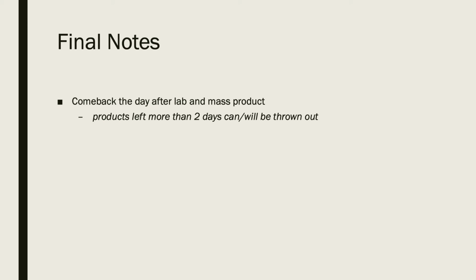All right, so last couple notes here. Like I said, once you have your final product, you're going to come back and just mass it the next day. Please try to come back and mass it in the day or two after you do your experiment. If the product's been left for 2 or more days just sitting in the lab and you haven't come back and massed it, it may get thrown out, because we have a lot of sections and we only have so much bench top to set things out and let them dry for a day. So if you don't come back and get your mass within 2 days, there's a good chance that we will throw your product away, whether you've come back and massed it or not.